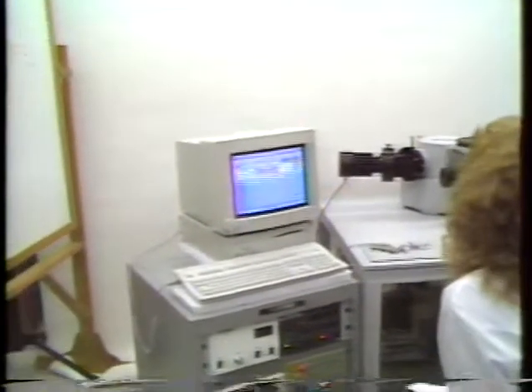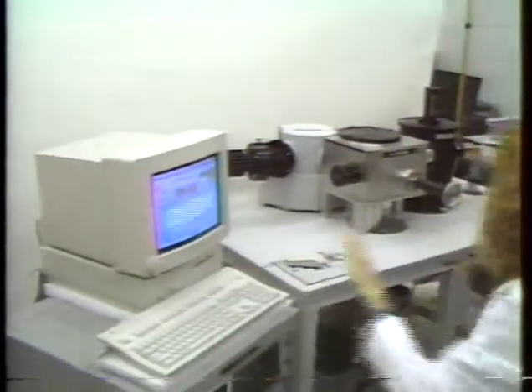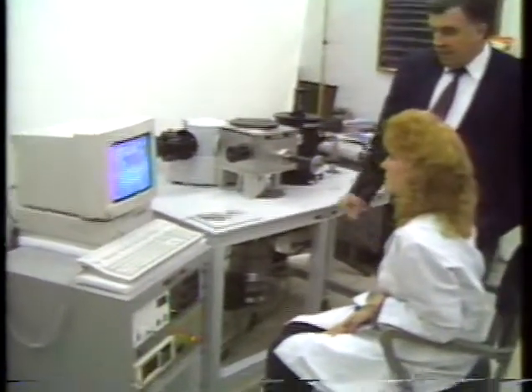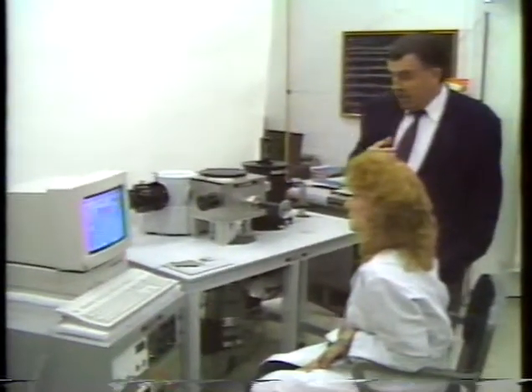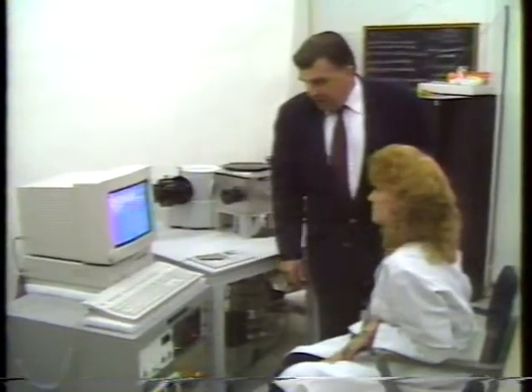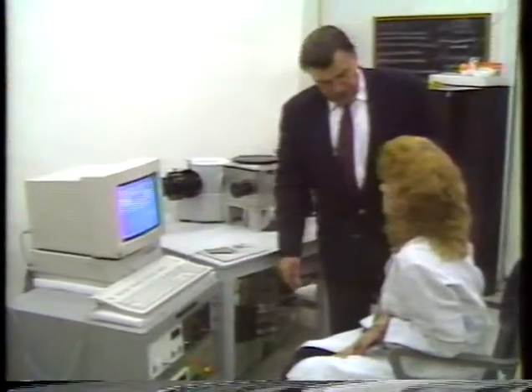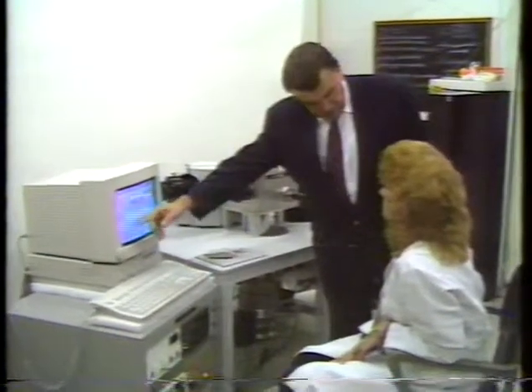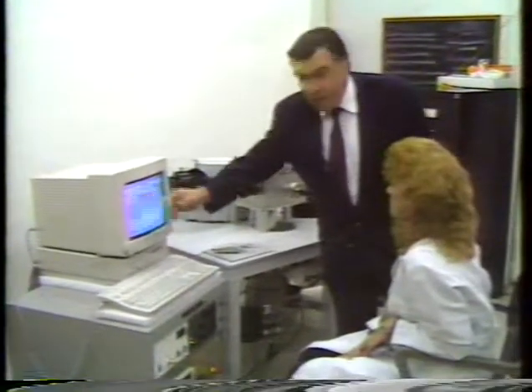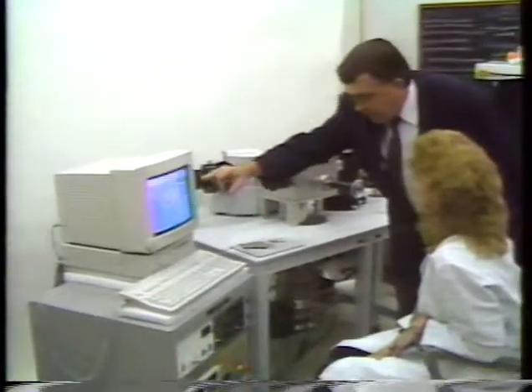And you do your reflectance or transmission scan. It reads actual reflectance here. Right. So there's no calculator. Yes. This is a selectable range. In other words, we can select the reflectivity or transmissivity by putting a transmission scale on here, which is 0 to 100, which would be 100% transmission amplitude. This will be showing on that particular scale. I think you have this in the software, so you can select it.